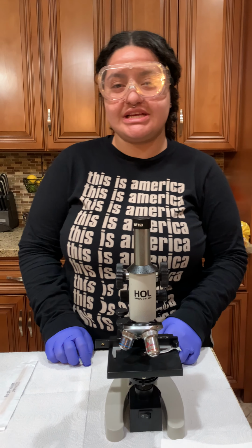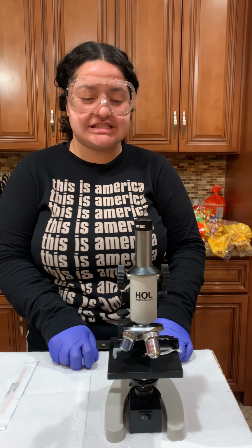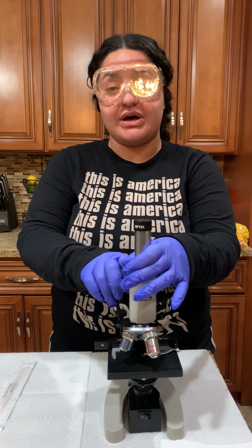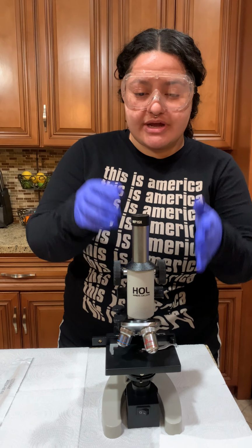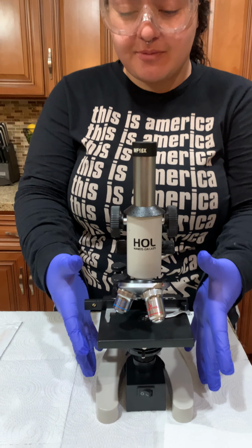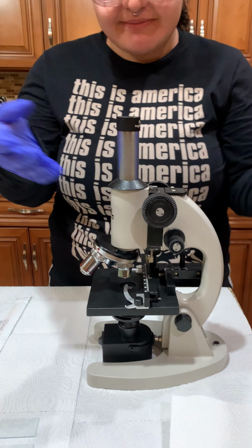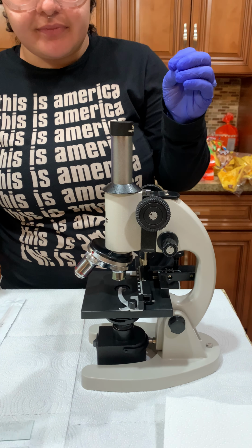This is Stacy Madrid. Today's date is November 17th, 2019, and this is week 3, lab exercise 1, or lab 1 from our 2 exercises. It's microscopy for microbiology, use and functions. So right here you can see I have my microscope. I'm gonna go ahead and talk about some of the important parts of the microscope and what their uses are.